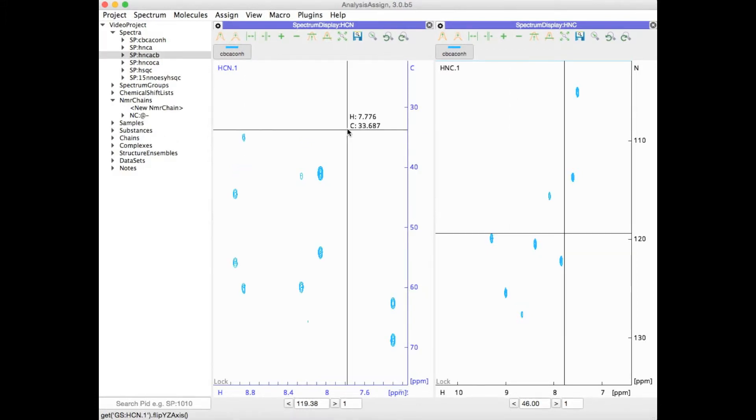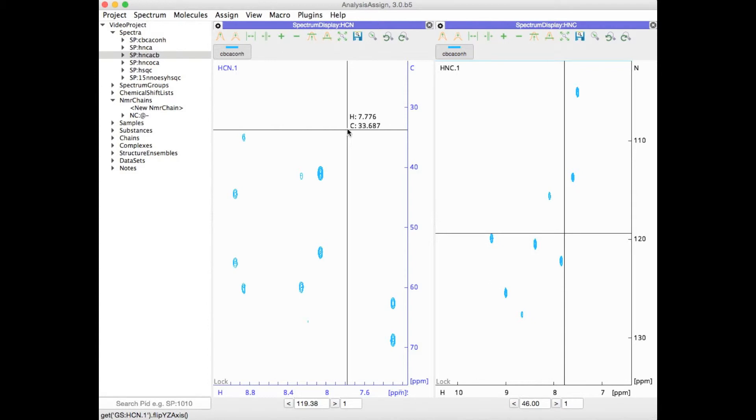The default axis arrangement keeps the directly detected dimension on the X axis. If there's another dimension with the same isotope code, usually meaning two proton dimensions, that will be placed along the Y axis and the remaining dimension goes on Z.